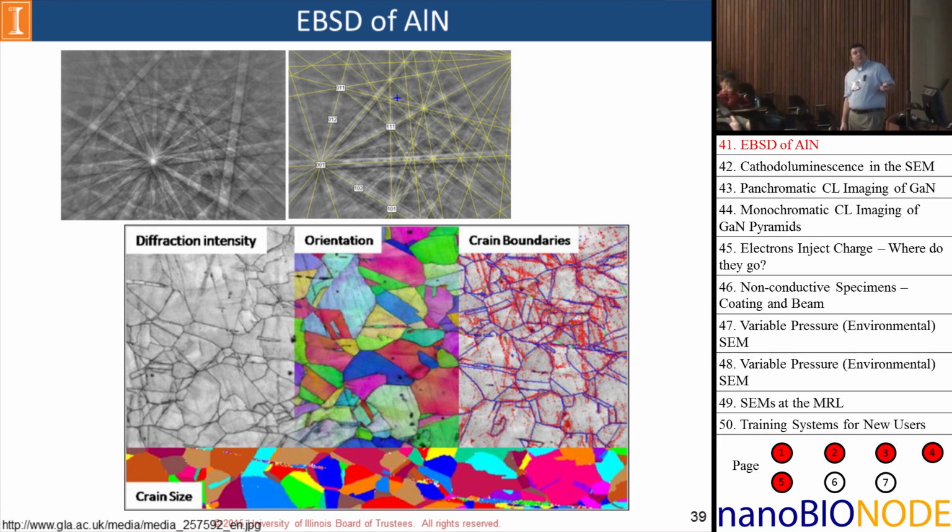Okay, we can see grain boundaries, and you can pick out the grain size of your sample. One thing I want to point out is this gives you the orientation, the microtexture of your sample. It's not exactly giving you phase, though. If you want phase, go talk to Morrow, XRD lab.